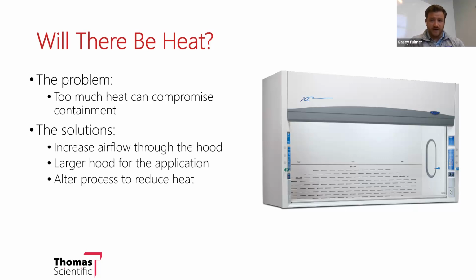You might need a larger hood if you're planning on using a 4-foot hood, but using a lot of heat. Well, it might not be a bad idea to look at a larger hood, like 6-foot or 8-foot, because a larger volume of air on the inside of the hood means it is harder to get to a concentration of heat that is too great. That heat will be diluted and dispersed amongst the greater interior of the hood. That could be a solution.